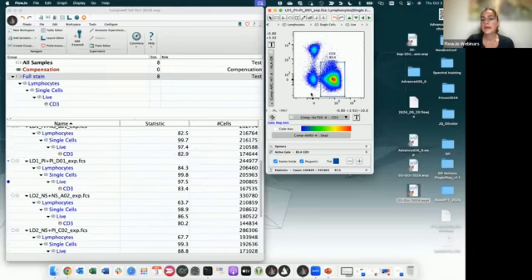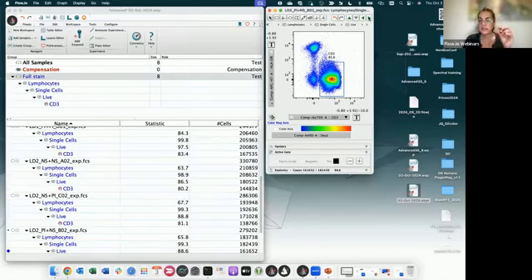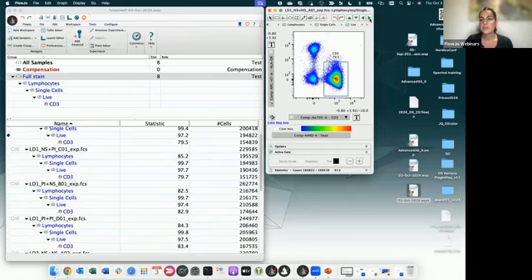If I apply this gate to the group, now it should automatically move to my population, as you can see here. And you see the arrow saying the distance, the size of the arrow indicates how far was the gate position. That's pretty much good. In this case, you see that the gate was a little bit shifted, and so on.